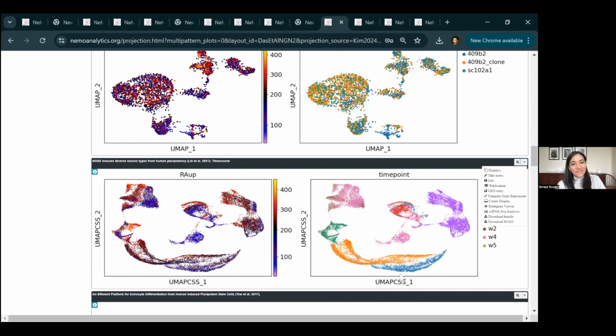Thank you, Soraya. We are interested in the Vaccarino lab to upload our data set in the NeMO. That's wonderful. I'd be very happy to work directly with you. We're trying to make that process easier and easier. If you work in R, we have R scripts that can take your matrices as arguments and package it up and add all the identifiers to it to make that easily possible. So absolutely, I'd love to work with you to help you do that and get more data in here.